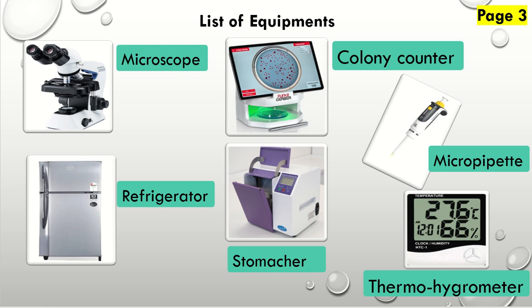This one is most important also because most of the culture media supplements and plates are directed to be stored at this refrigerator temperature. Thus, we need refrigerators. Also for samples. This one is also a requirement.